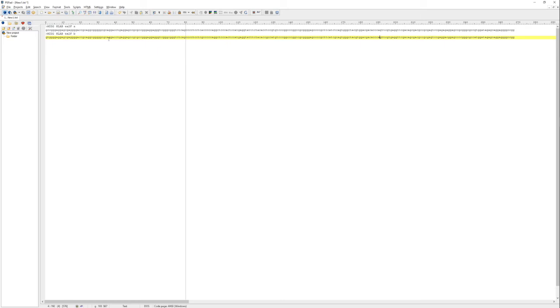So what I would now do is I would repeat this for exon 2 reverse and create 2 more consensuses, and exon 3 forward and reverse, and then I would repeat it for HLA A and C and for the other mids. And then once you have all of those, you can move on to the next step.